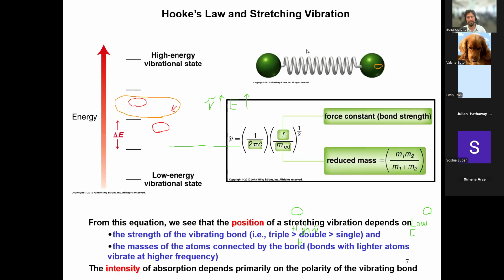There we go. Alrighty. So again, just one more time, I want to emphasize that the logic behind this is just a spring model. You can think of this green sphere as oxygen, for example, and this other green sphere as another oxygen. So you have a spring, you have two masses between them, and it takes a certain amount of energy to vibrate that spring like an accordion.